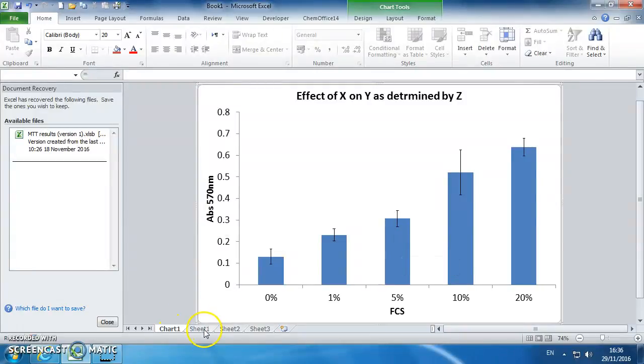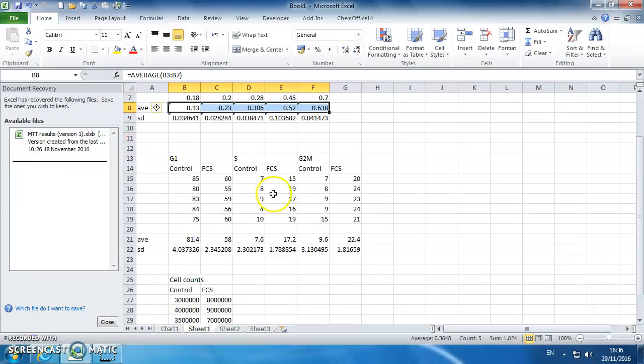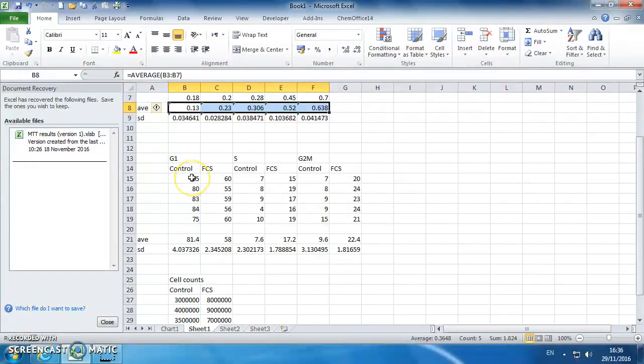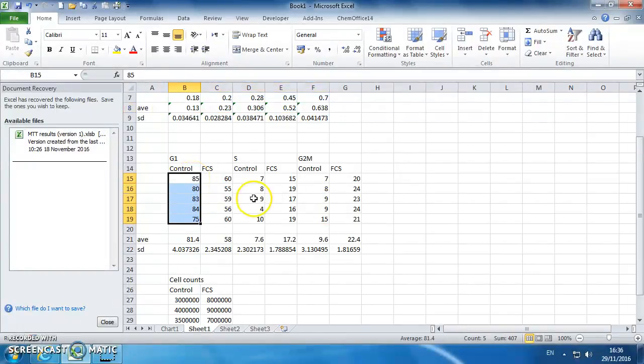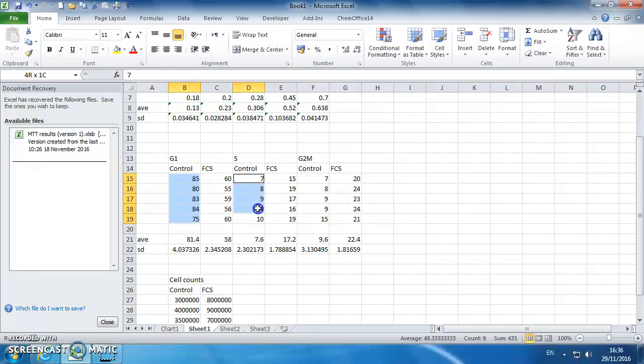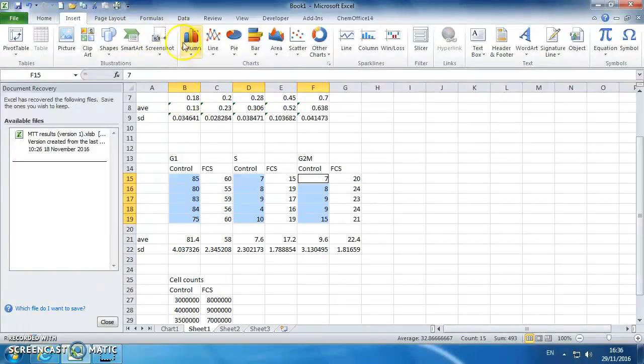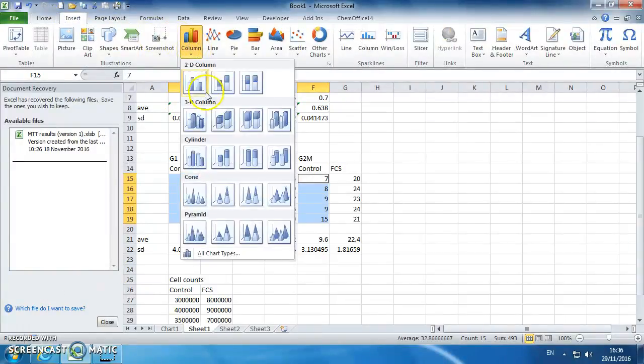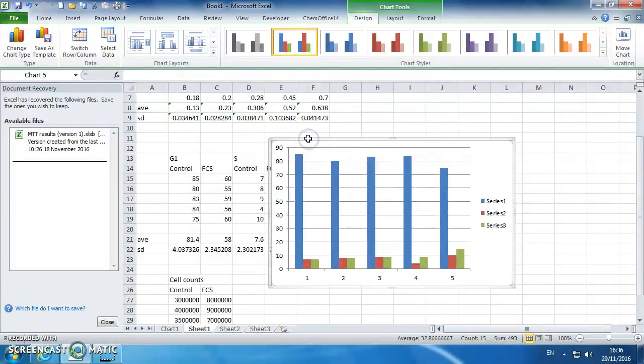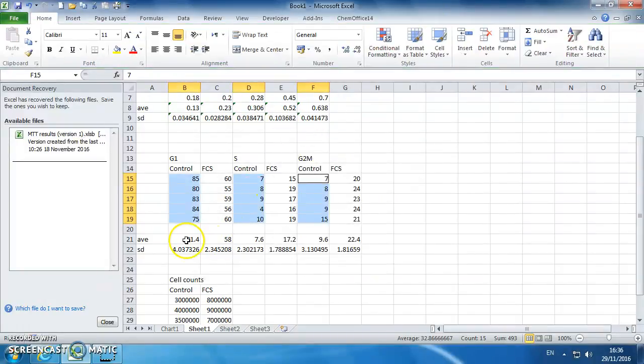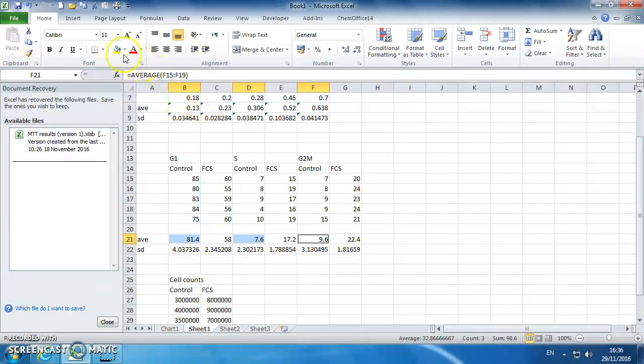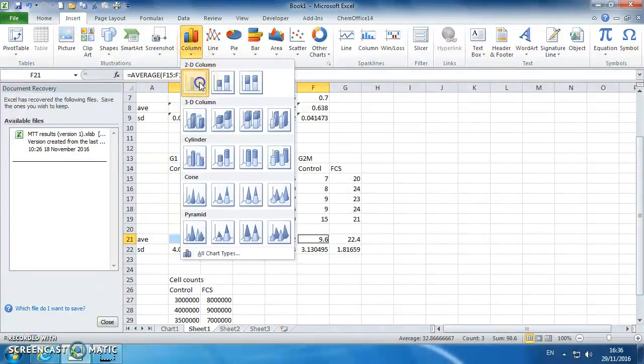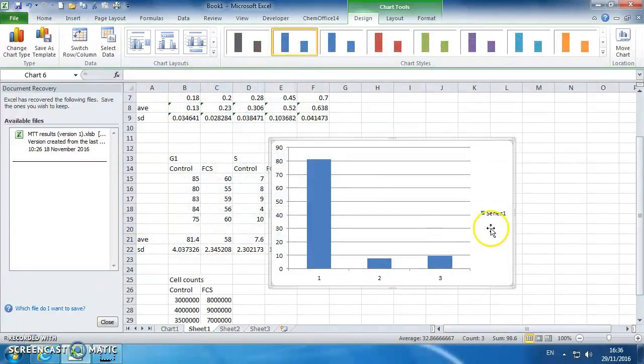So that's your MTT data. Your flow cytometry data is a bit more complicated because you've got G1, S and G2M. So we can highlight three series, go to insert column. In fact don't do it that way, that's wrong. Highlight your three standard deviations for your control, control, control, insert column, standard graph like this.